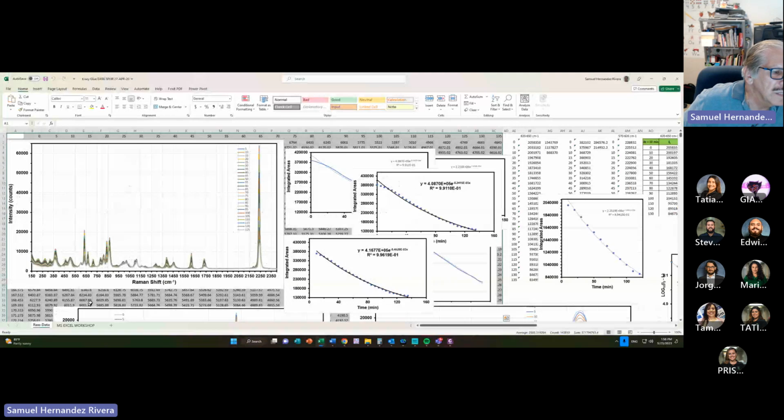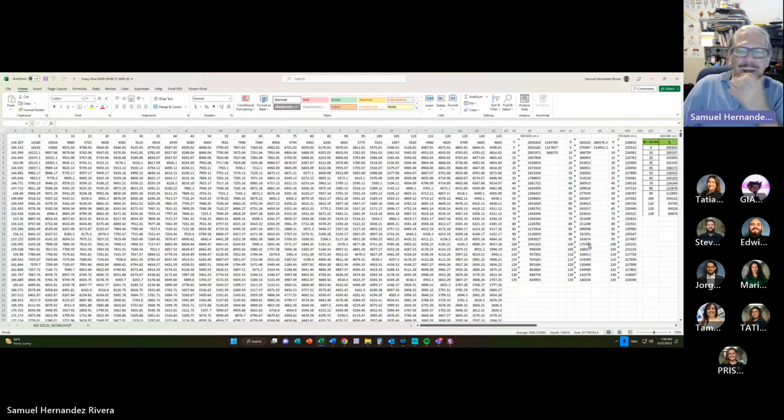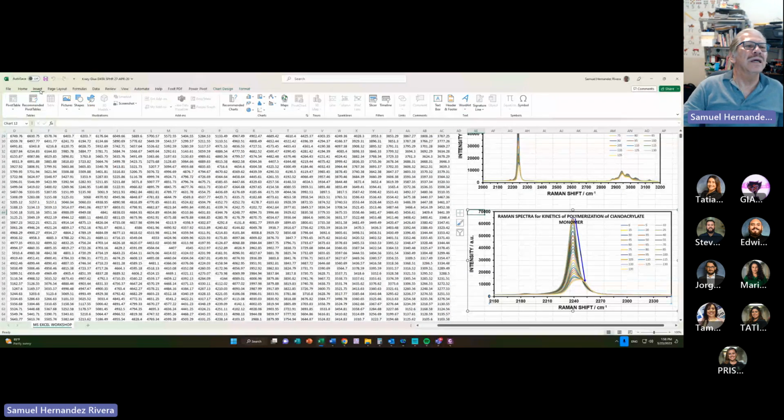I'll delete the original data if I want to send this to you. Okay, so we're with the MS Excel workshop. Okay, let's insert a text box.